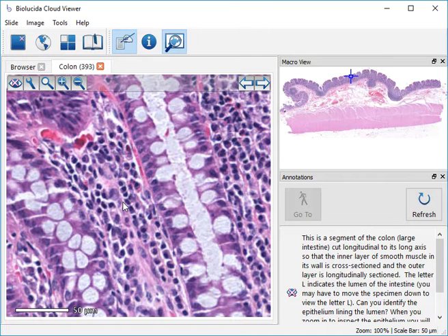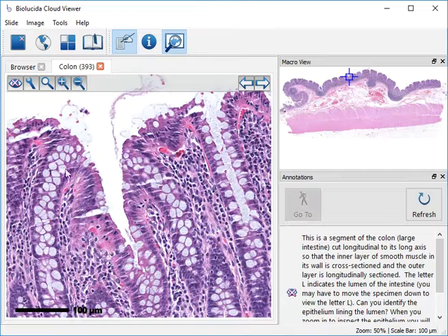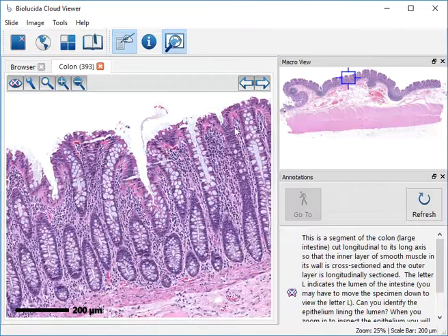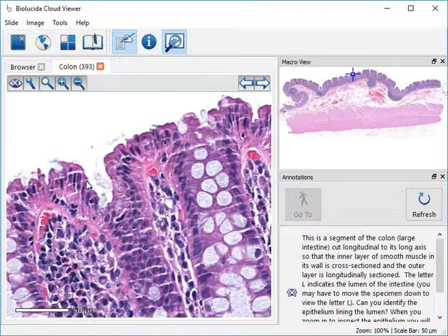But over here is the loose connective tissue containing lymphocytes, macrophages, fibroblasts, and very delicate collagen fibers. And at the very surface, you have to kind of look around because some of it's eroded. So I'm just going to look over here. This is perhaps a fairly good example, simple columnar epithelium that doesn't have goblet cells in it because these cells are absorbing water from the lumen of the intestine.